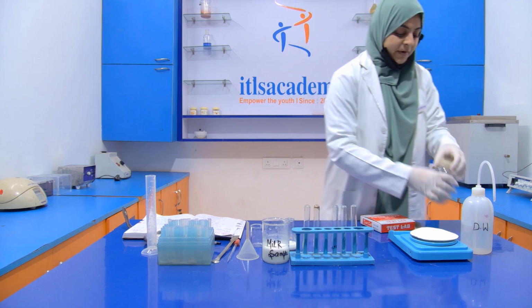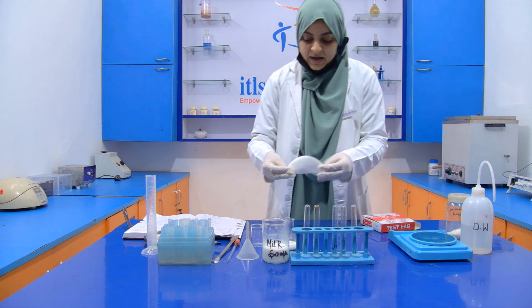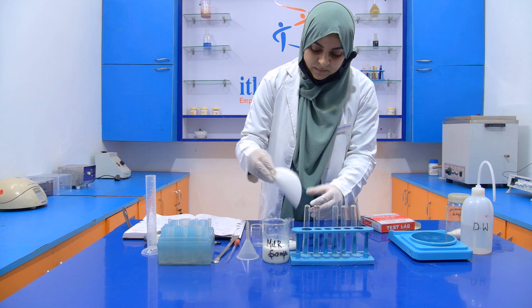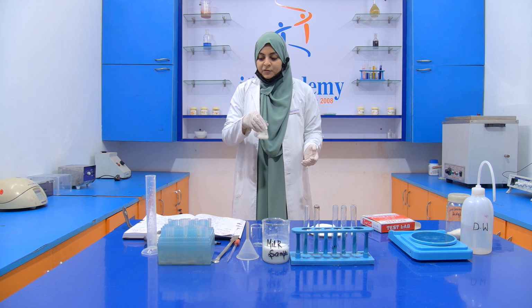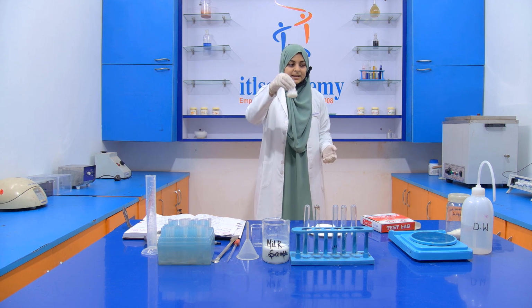Now we have to transfer that ammonium sulfate into the conical flask. When you are transferring it, you have to transfer it very carefully. Now you have to mix it properly, and we have to mix it for at least 1 minute like this.